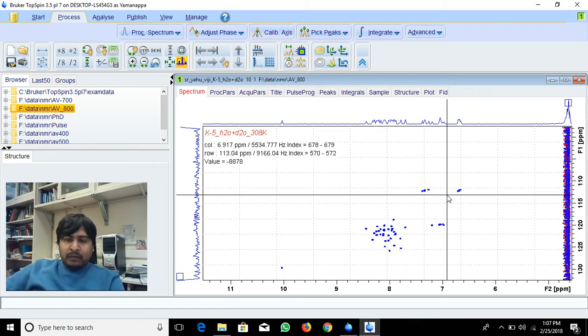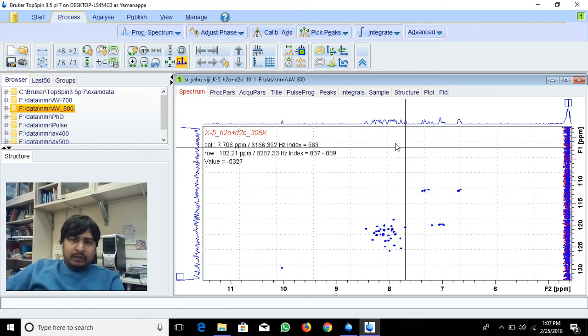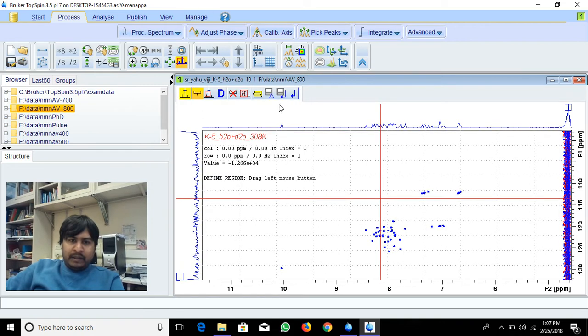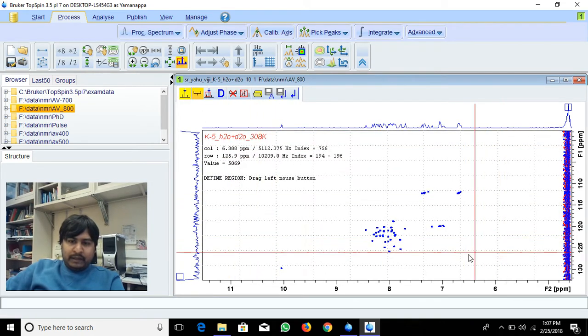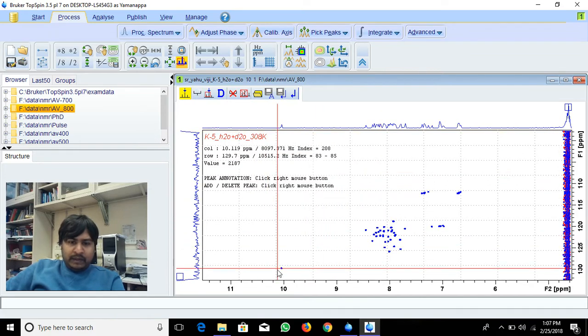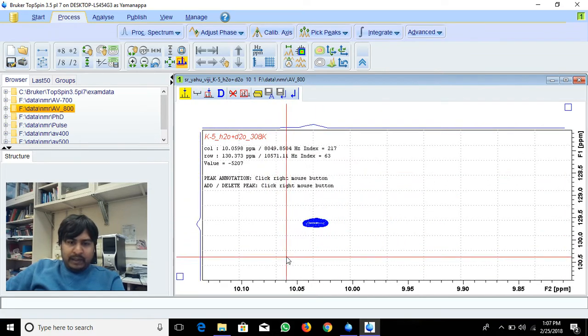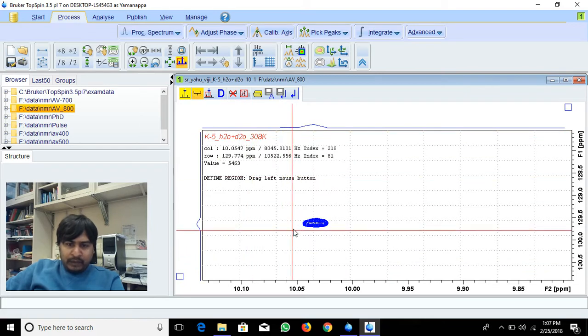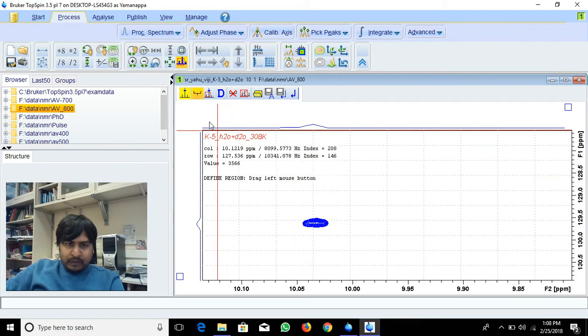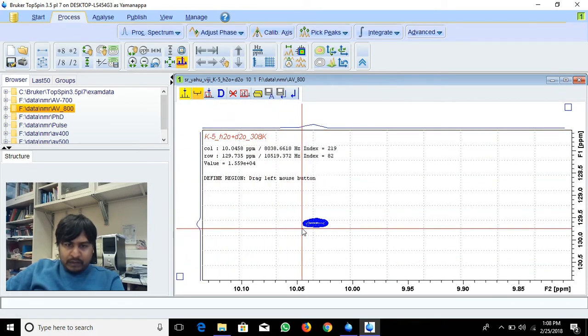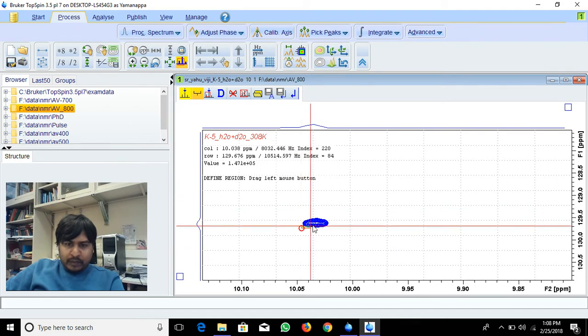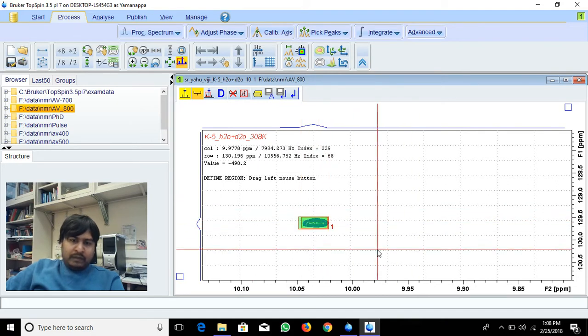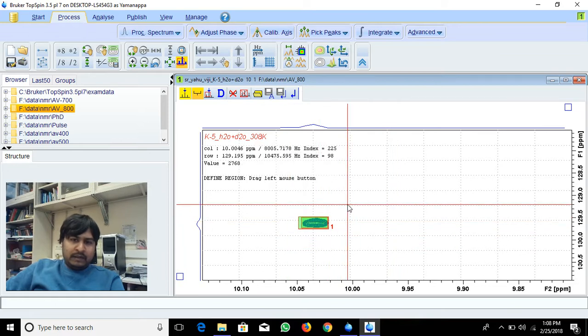In the Monday tutorial we did peak picking in processing, and here we have to select and drag. Same thing you can do here, but you have to select the proper area. If you want to drag, select the peak picking mode, select the proper area and release it. This is how the peak will be selected.